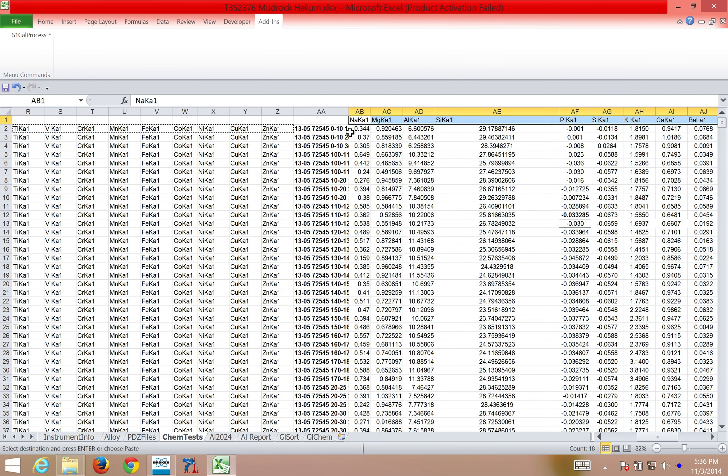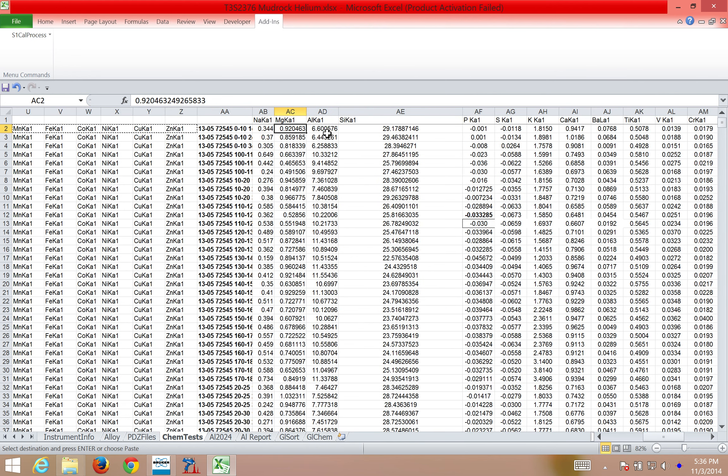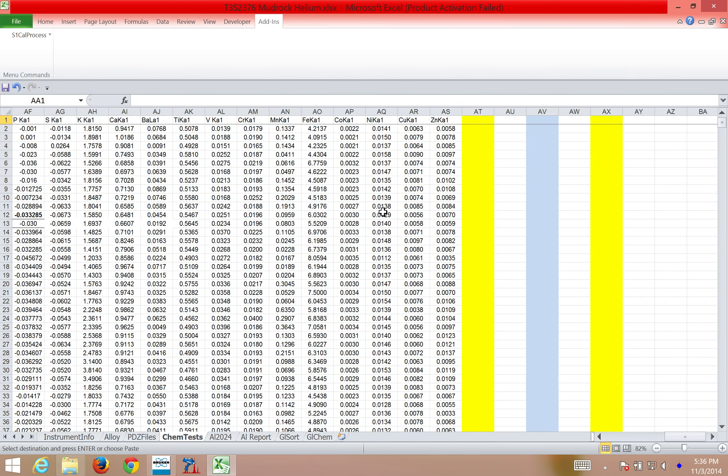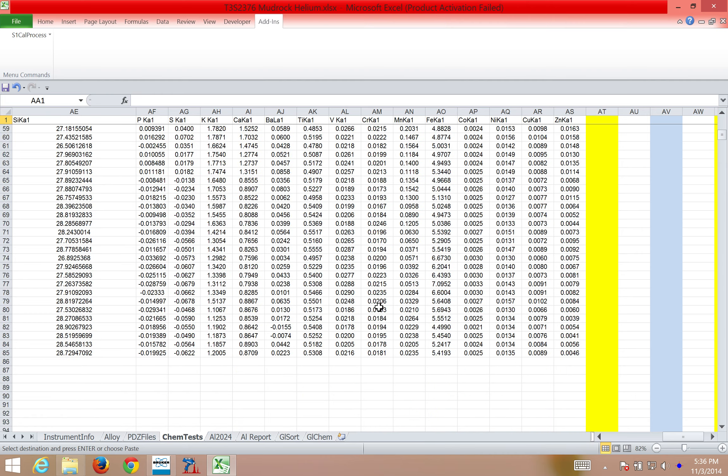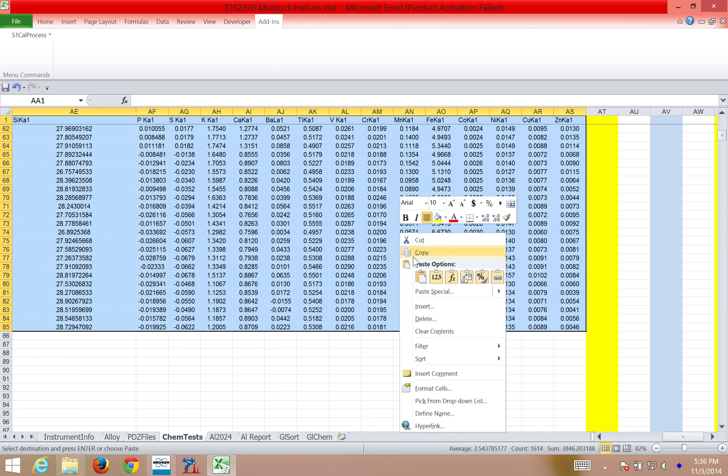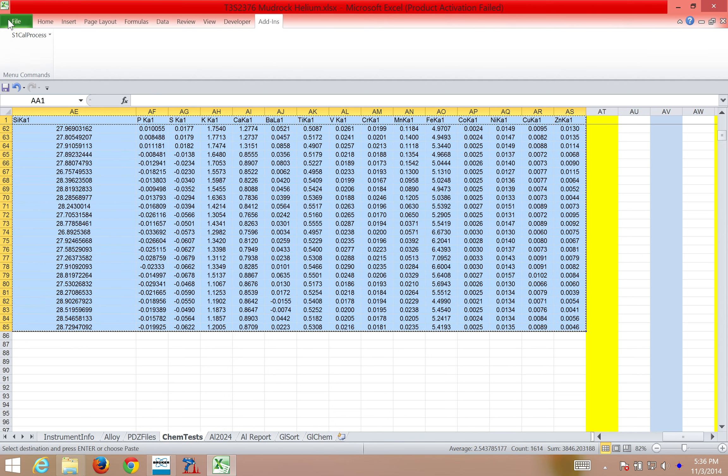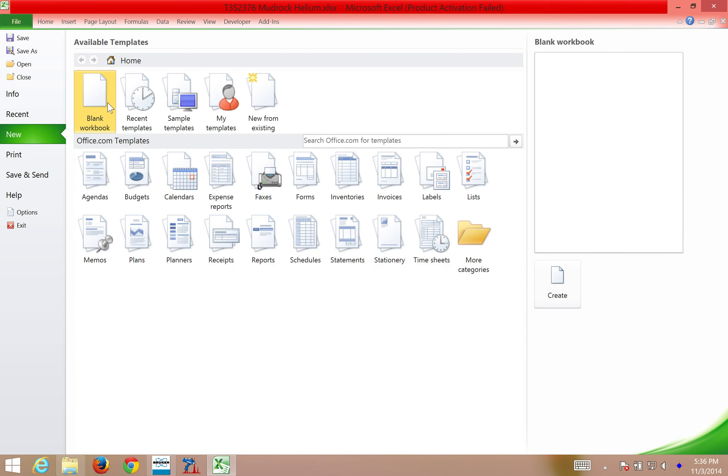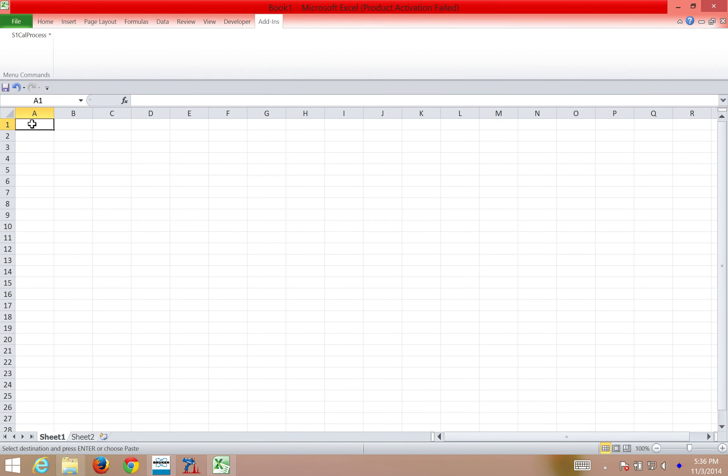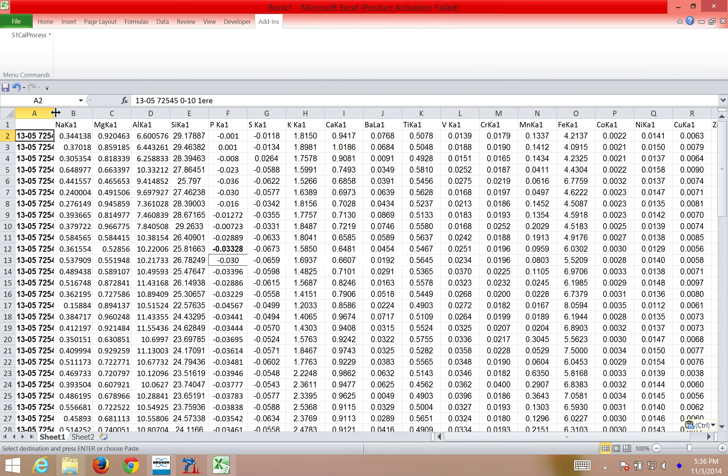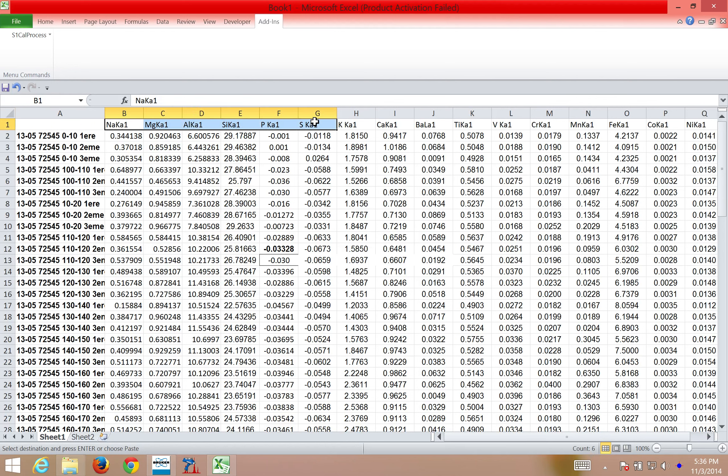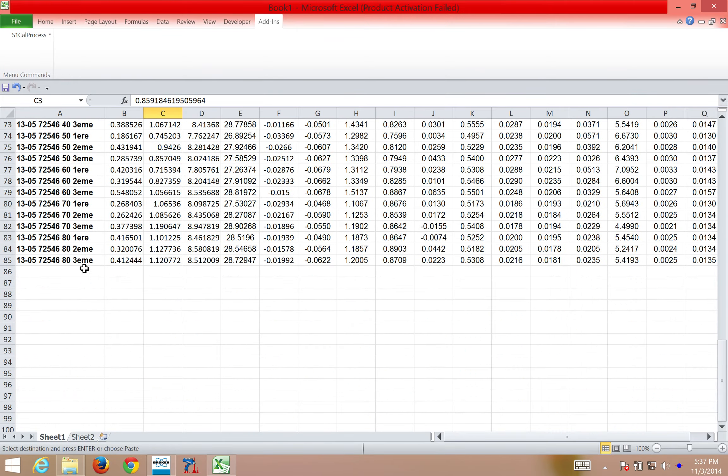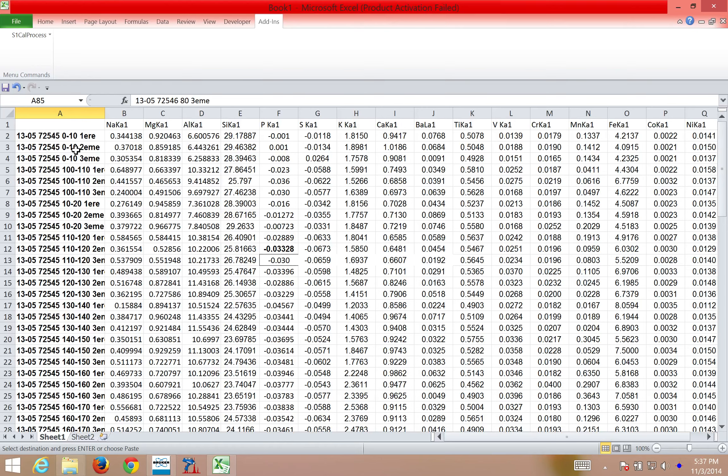So now you can see, sample 1305 has 0.34 weight percent sodium, 0.92 weight percent magnesium, 6.6 percent aluminum, et cetera. If I want to, I can come over here, I can select these, copy them, create a new spreadsheet, and paste that data here. So now, I've got a nice table with all my samples and all my spectra quantified. This can be done for any element range and any calibration. The sky is the limit, and you can quantify a lot of data. In this case, I've only quantified 85 data points, but you can calculate thousands to tens of thousands of data points all at once using this method with S1CalProcess.